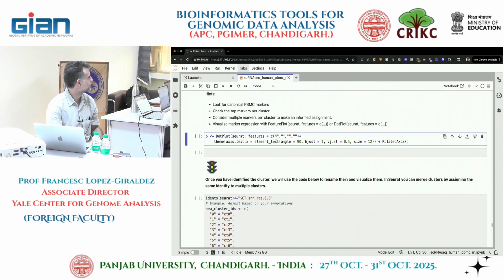Okay, now that you're here close, what genes in your cluster 1 do you think are important in cluster 1? CD8A, CD8B, KLRK1. Look at the screen and let me know if I'm spelling that right.